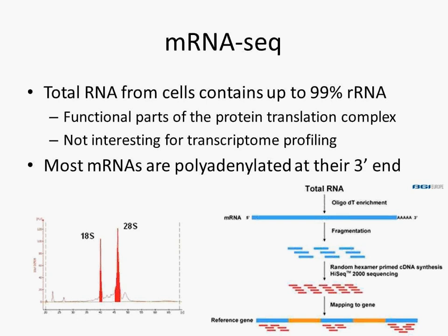Just philosophically speaking, one of the main goals for doing RNA-seq at all is to capture information qualitatively, not just quantitatively. That would be different than your typical really, really good gene array. So a lot of people might want to do RNA-seq to get RNAs that a gene array could not capture, not just quantitatively but qualitatively.